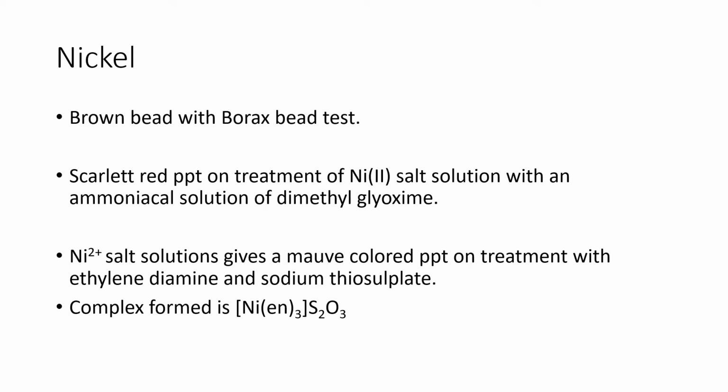Another test which we can consider for the detection of nickel is that nickel salt solutions give a mauve colored precipitate on treatment with ethylenediamine and sodium thiosulfate. Here the complex formed is the tris-ethylenediamine complex of nickel, nickel being in the +2 oxidation state.